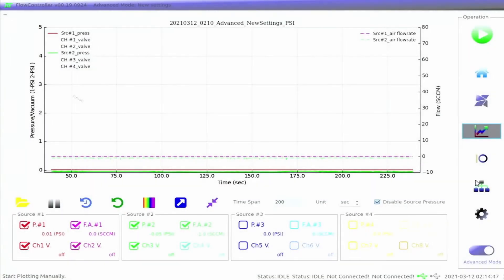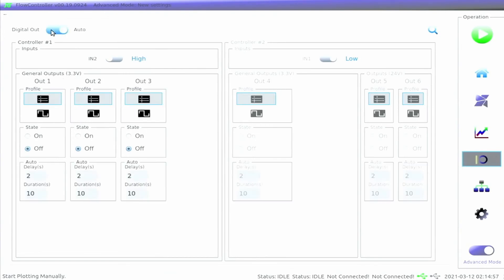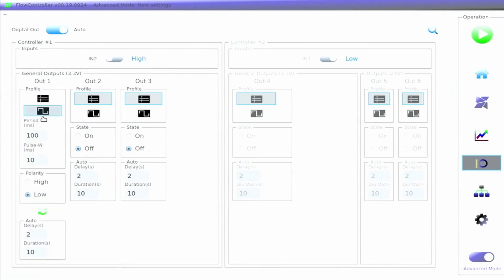Click on the digital output icon in the function zone to access the digital output page. Here, the digital output can be toggled on or off, and individual outputs can be activated by changing the state. If a wave profile is changed, then the user will also be able to adjust the period and pulse width.